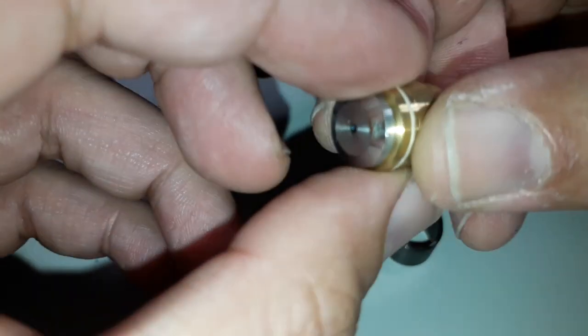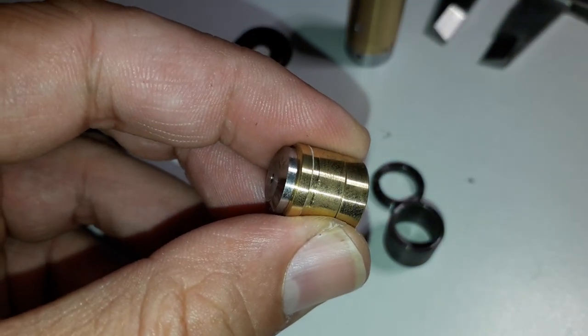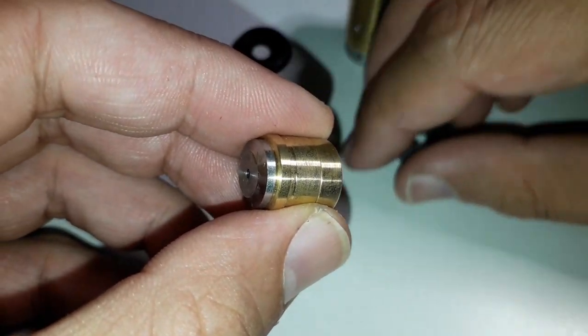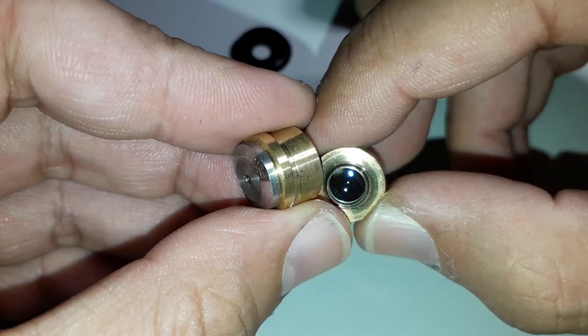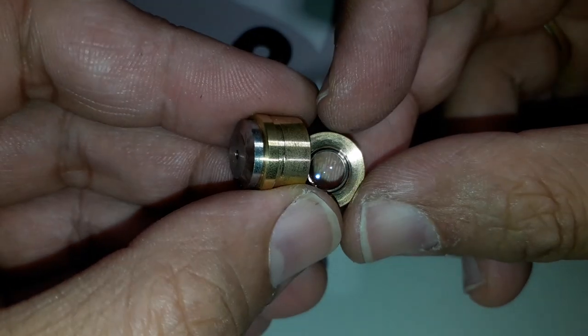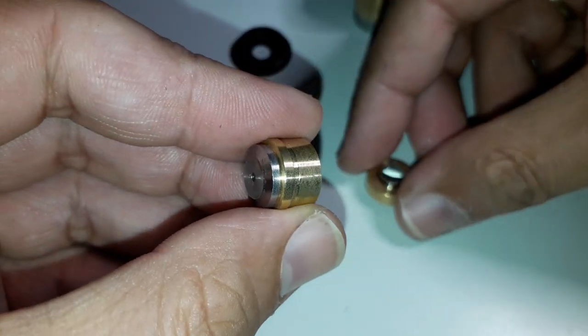I did not take it apart any further, because I did not want to damage the individual lenses themselves. So that is basically how it was put together. It could be that these are not individual lenses, but actually doublets, or even triplets — I don't know. I have not taken it apart further.